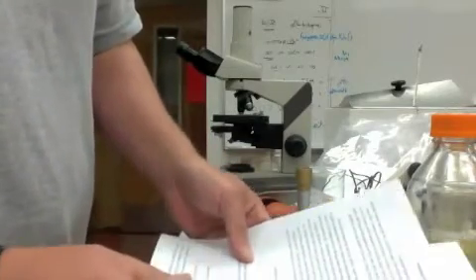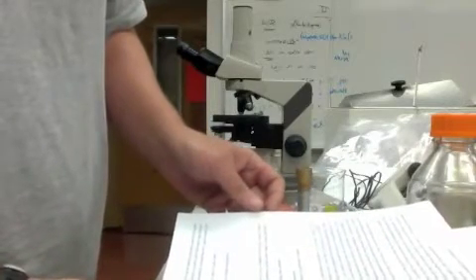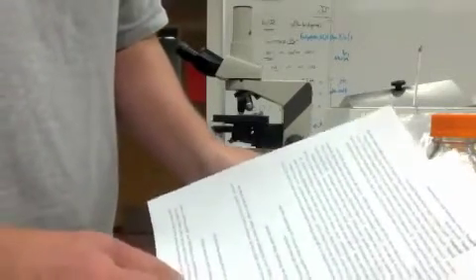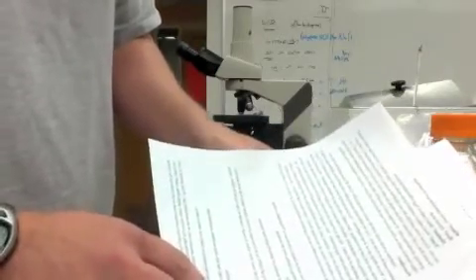For Bacillus and Clostridium, nothing hugely important there other than to heat up your samples and realize, keep track of what you're doing and which sample you're using for what. You can give Chris and I the Clostridium samples and we'll show you how we're going to incubate them anaerobically.